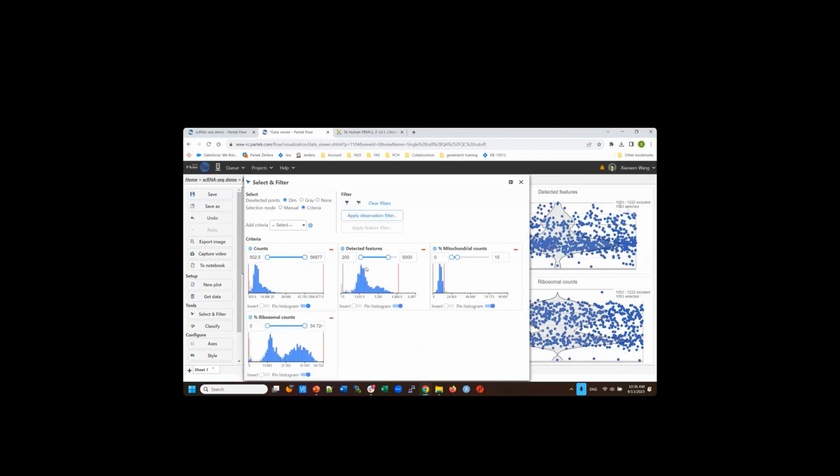So now this will only select them. I didn't filter, and here is a filter include. This is a filter exclude. So I will choose filter include, or you can save at this stage too. It's up to you. But this filter is only in this data viewer session and is not reflected in your analysis pipeline. So when you save this session, next time you will know the filter is in the data viewer.